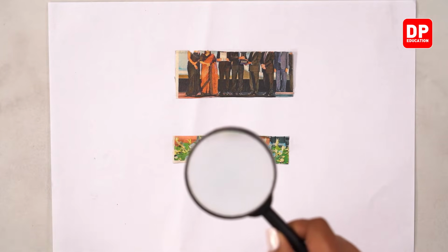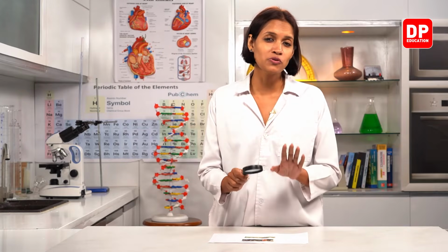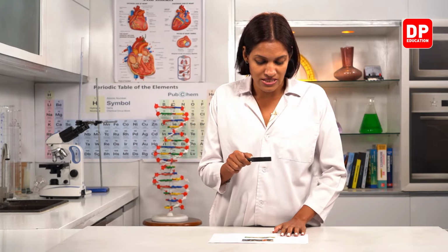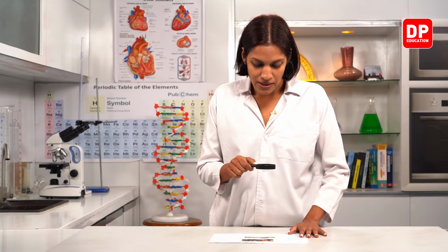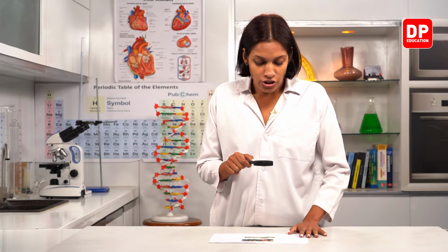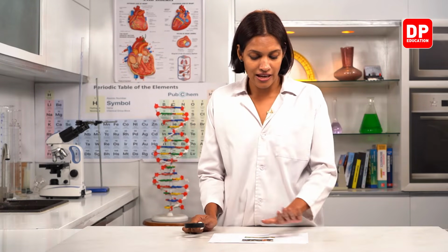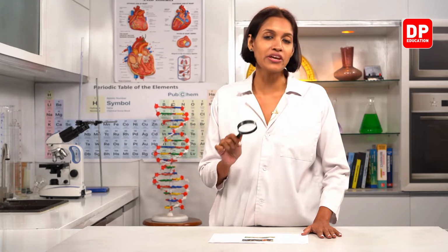Sometimes you might not be able to observe it very clearly with the camera, but at home you all can do this activity, right? Specifically, you have to take a news picture or a very colorful picture taken from a newspaper, so you can observe this effect very well. So I can observe these tiny dots very clearly. It's very clear both the pictures are made up of very small dots. But without the hand lens, I cannot see any of these tiny dots. Only with the hand lens, I can see the tiny dots.